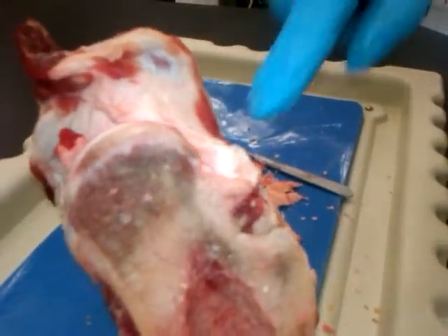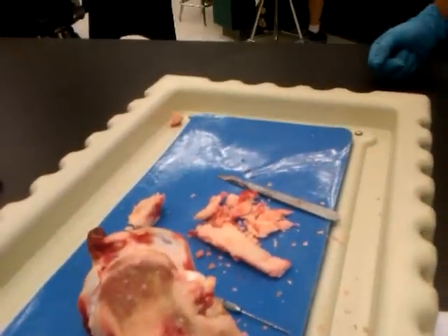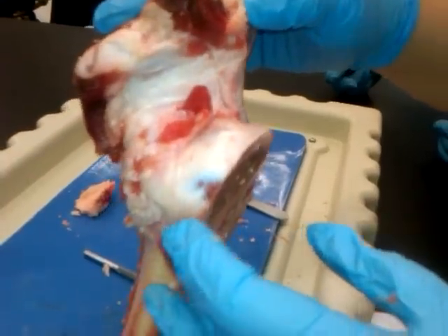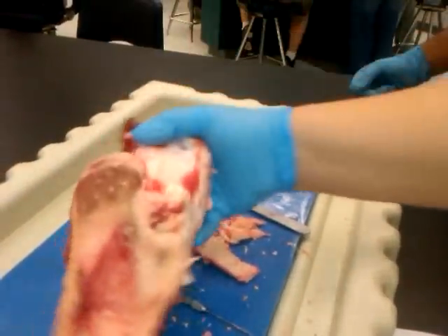It says tendon on my paper — right there, the top part. And then you're supposed to have the hyaline cartilage, which you really can't see on ours very well, but it should be right there. So I think that's it.